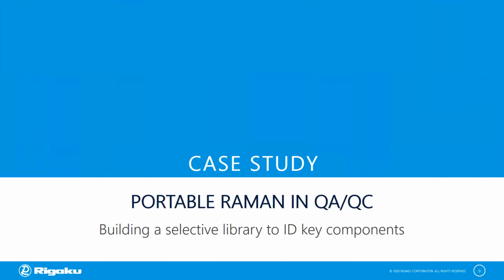Okay, so we're going to look in a little bit more detail and expand on an example for the next couple of slides, and show how a selective library might be built and tested in a QA/QC environment. This application and this library can then be implemented at line of a process prior to adding the materials.